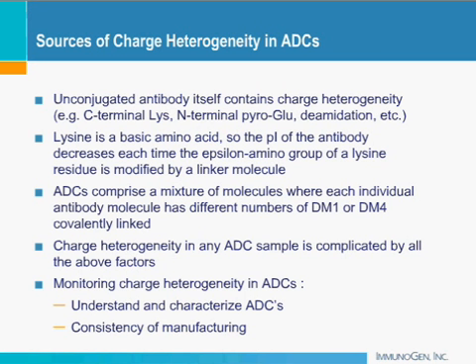For the mass spec profile, you have the unconjugated antibody coming out on the left side, and then as drug molecules are attached to the antibody, its mass increases, and you have this mass distribution profile spanning right. But this also shows very well that ICIEF is capable of generating data which is very comparable to what we get from sophisticated methods like mass spectrometry.